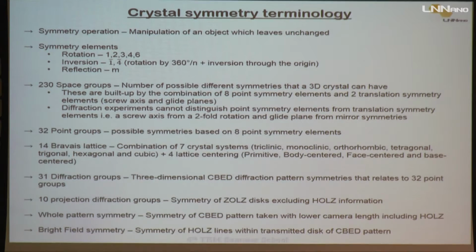And by including the HOLZ information, we get the whole pattern symmetry, and by looking at the symmetries in just the central CBED disk, we get the bright field symmetry. So these are really important things you need to understand when you're working with symmetry analysis using the CBED technique.